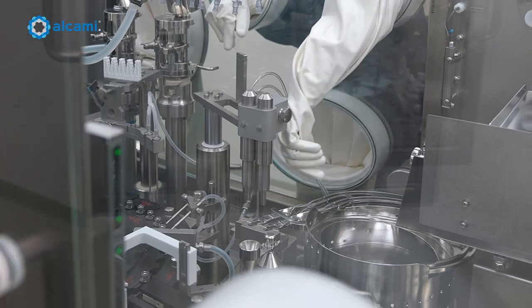When Alcami reached out to us, we were absolutely thrilled to support, because flexible machine concepts for sterile filling are among the things we do best.